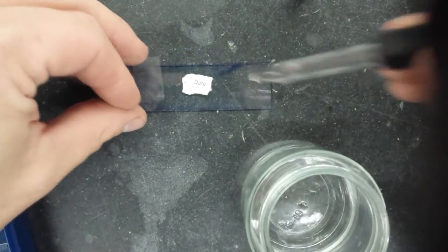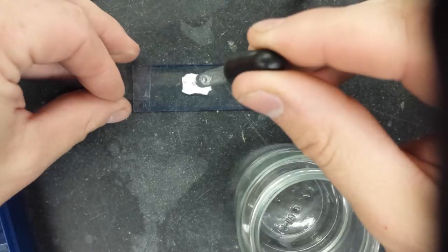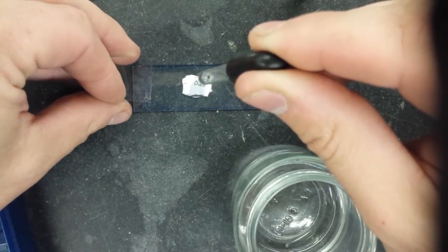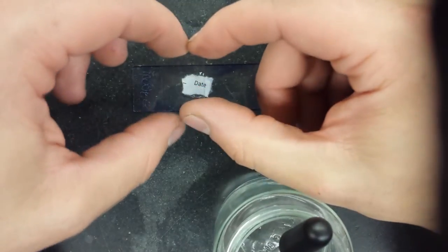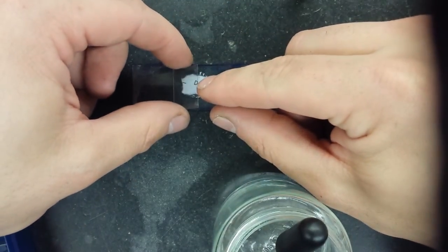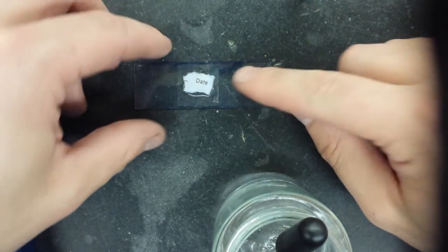Put a drop or two of water. This specimen is a little bigger than normal so I'm gonna put two drops. There's one, there's two. Hold the cover slip at like a 45 degree angle as such, drop it down.